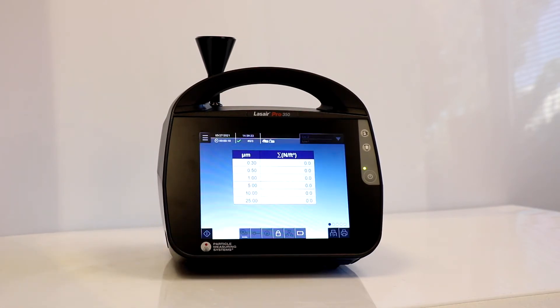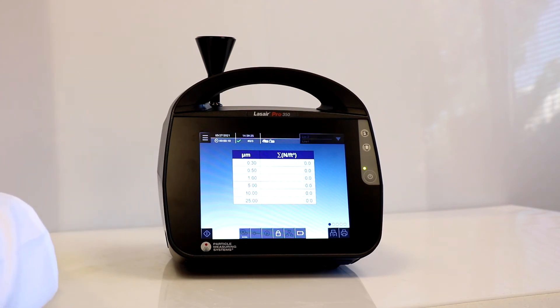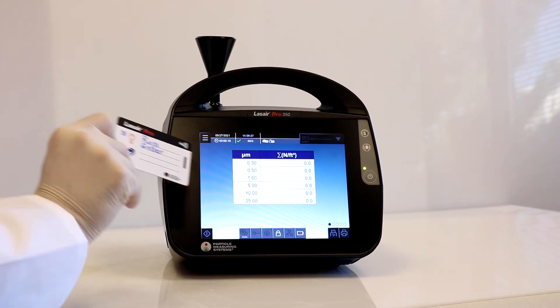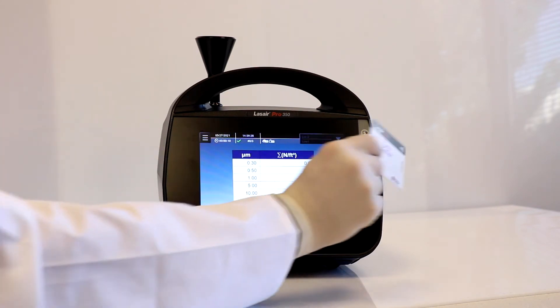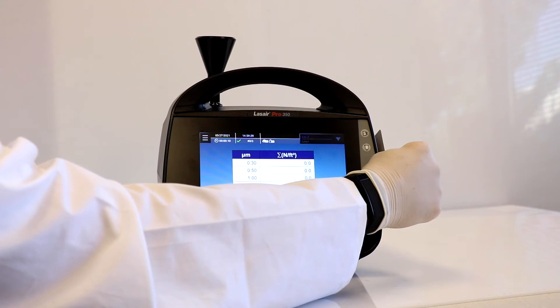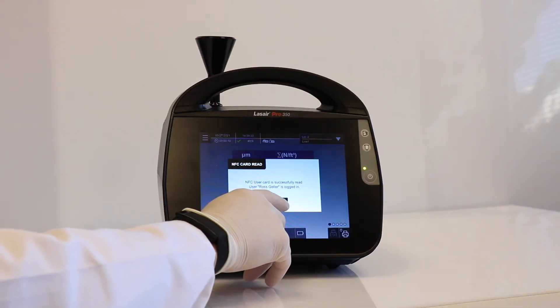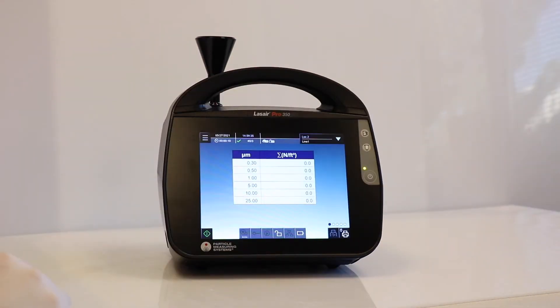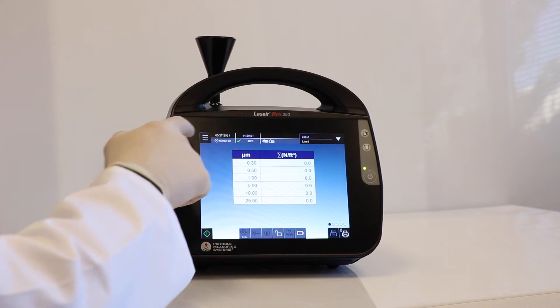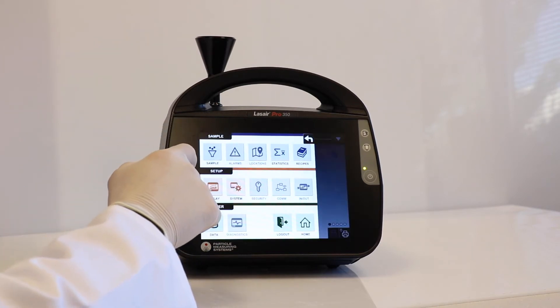We will make a few changes on the unit in order to create audit data. First, we will log in a user with the NFC tag. We'll select a recipe and load it to the unit.